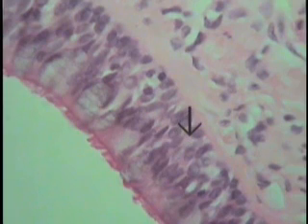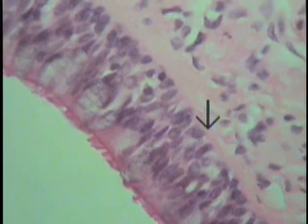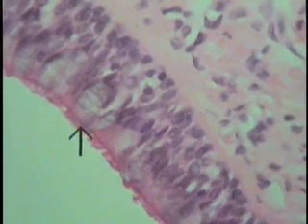The reason this epithelium looks a little bit worse for wear is because this is a typical paraffin section rather than some of the crisp plastic sections that are used and observed in other tissues elsewhere. So it looks a little bit thick and is muddy in nature. If we look along its surface, you can see, melded together, clumped together, these little projections here are cilia. And cilia are typically found within the respiratory tree, obviously for functional reasons.